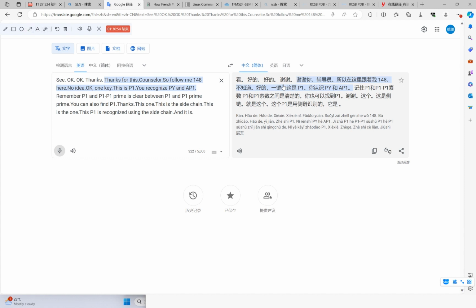So you take this and find this. Now you want to find the oxy-anion hole. The intermediate, you look at this one.